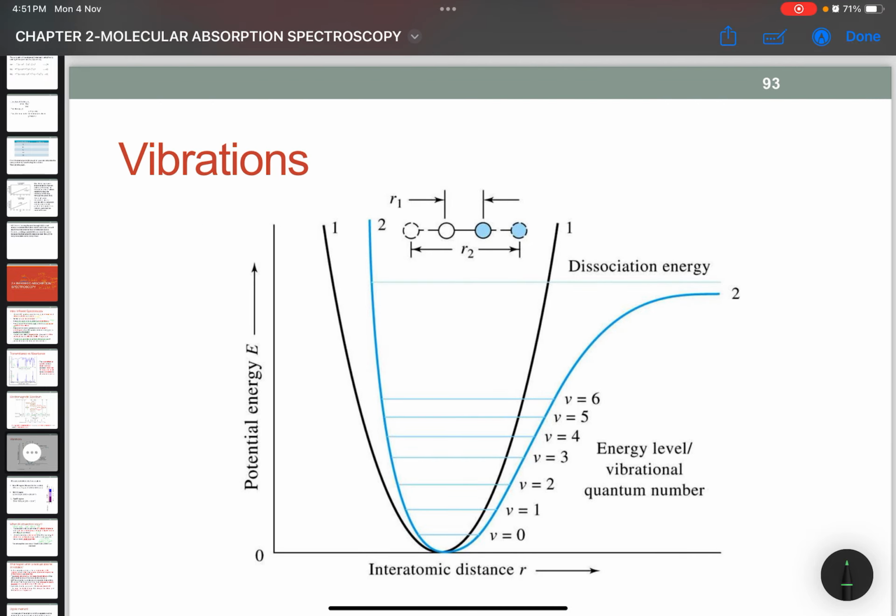This one lah dia tunjuk ni dua molekul ni kan. Yang ini maksudnya dia expand, bond ni makin jadi panjang. Nampak dia expand ya. So when it expands, it is actually absorbing energy. So bila dia absorb energy, dia boleh expand, and bila dia expand, if there is a net change of dipole, maksudnya sebelah sini delta negatif, sebelah sini delta positif, then dia boleh absorb IR. No, sorry. Ya, dua-dua absorb IR, tapi kita boleh observe.